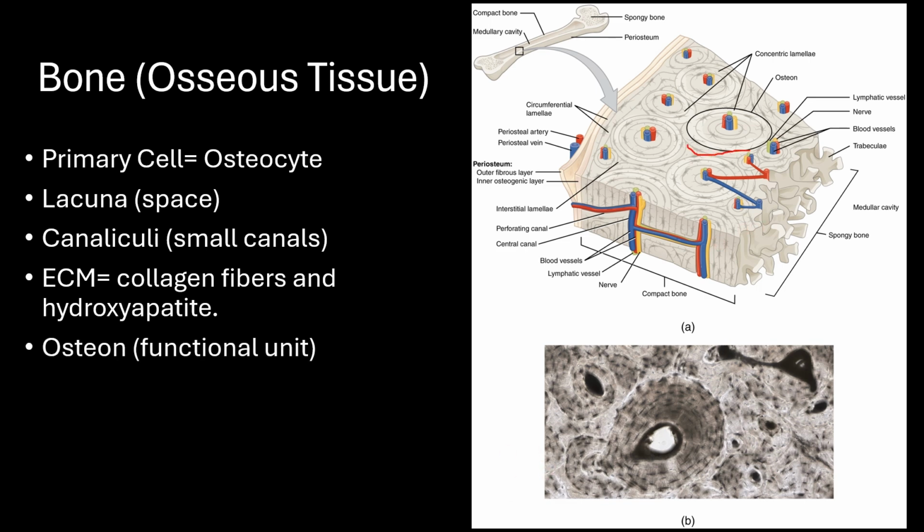First, the osteon. Right here's one. There's another one over there. So these osteons, they are the structural and functional unit. It's essentially how bone tissue is organized to have its strength. They are cylinder-shaped and arranged in parallel lines to the stress of the bone.